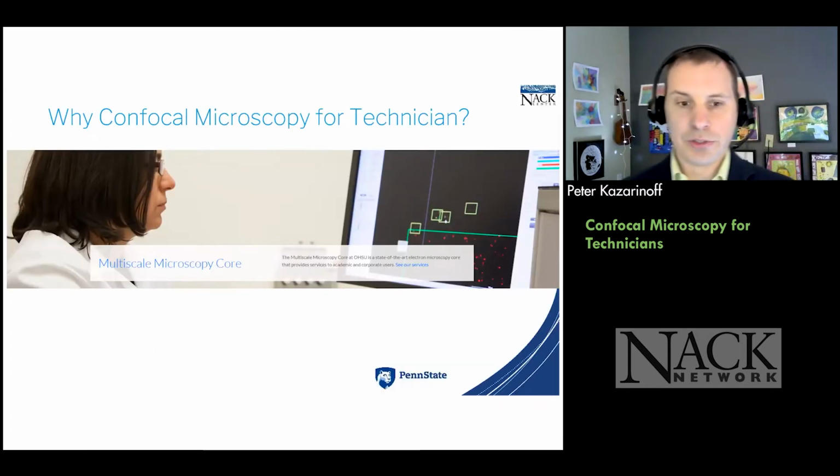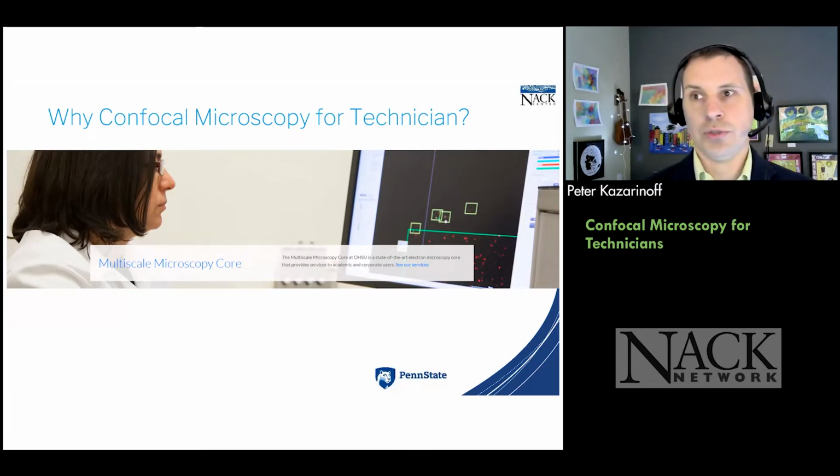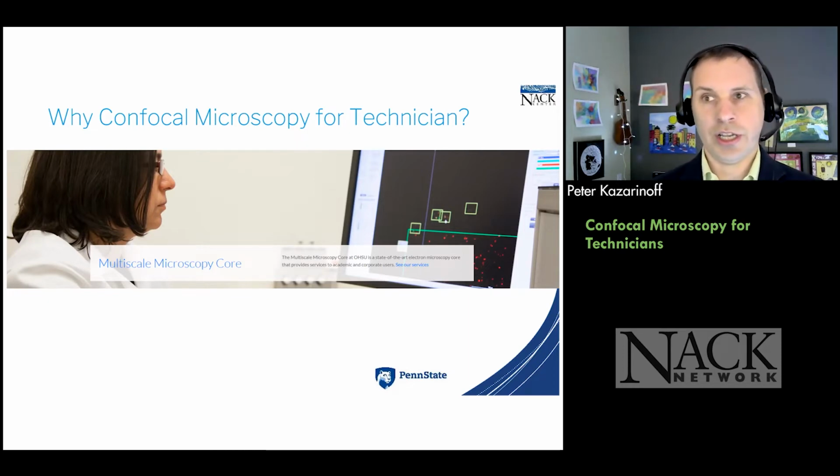Confocal microscopes don't resolve down to the nanometer size scale like transmission electron microscopes or scanning electron microscopes. So why would we teach technicians who go work in the nanotechnology industry confocal microscopy? Why don't we just teach them SEM, TEM, AFM type methods?